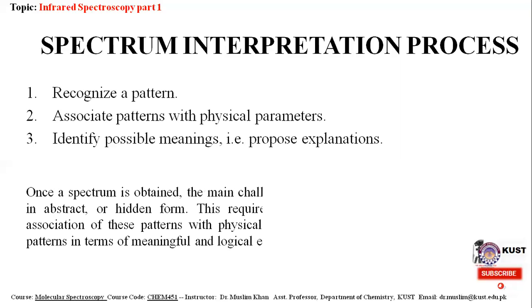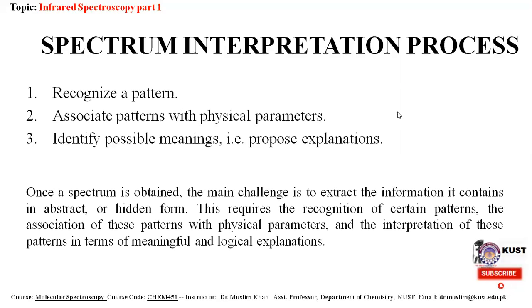Once a spectrum is obtained from the instrument, the main challenge is to extract information and explanation, which is contained in an abstract or hidden form. This requires first recognizing a certain pattern, then associating this pattern with a physical parameter, and then interpretation, extracting a meaningful, scientific, and logical explanation of these patterns from the spectrum.